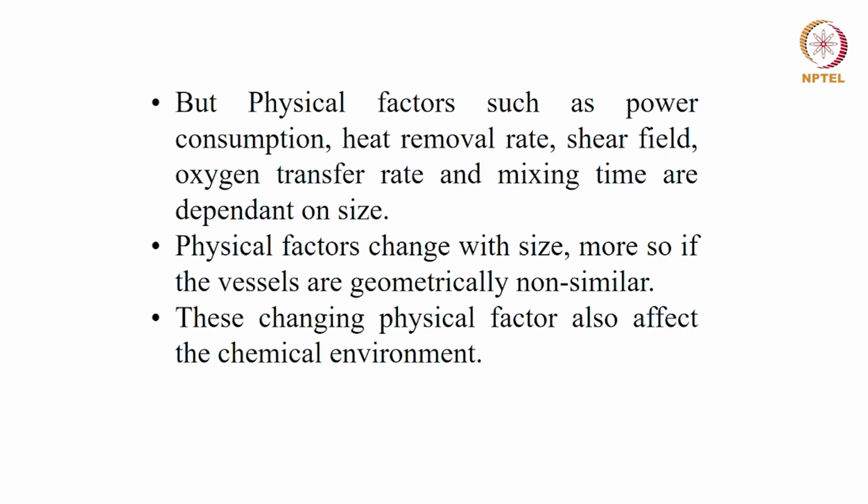But physical factors like power consumption, heat removal rate, shear field, oxygen transfer rate, and mixing time are dependent on size. Therefore, these factors can change with size, and more so if the vessels are geometrically non-similar. These changing physical factors can in turn affect the chemical environment.